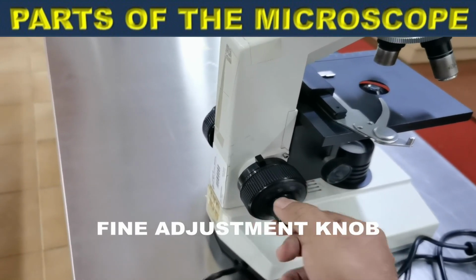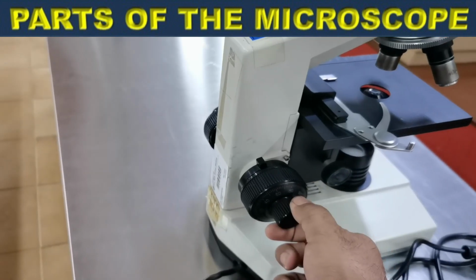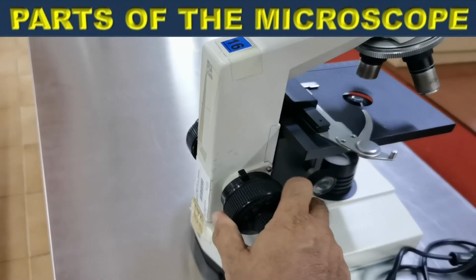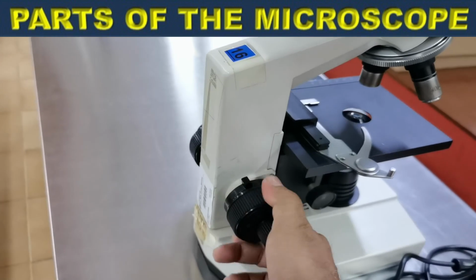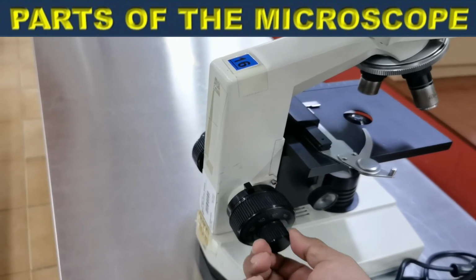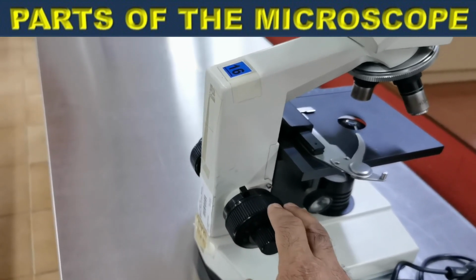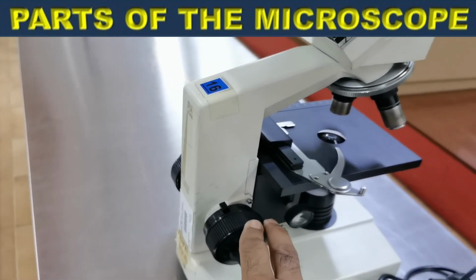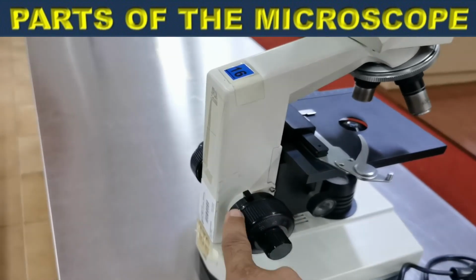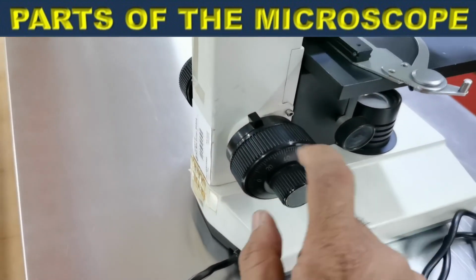The fine adjustment knob is for final focusing of the image. The initial focusing is done by the coarse adjustment knob by moving the stage up or down. Then the final focusing is done by the fine adjustment knob for a fine, crisp, and clear image of the specimen. Alright, so coarse adjustment knob, and we have here the fine adjustment knob.